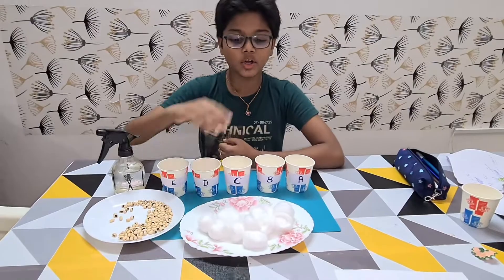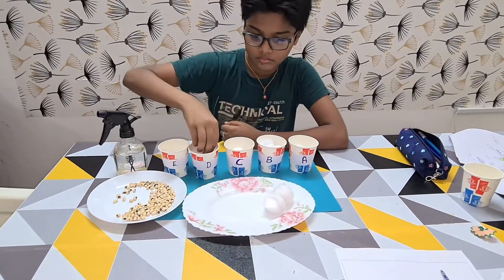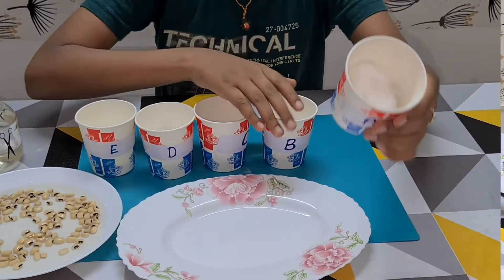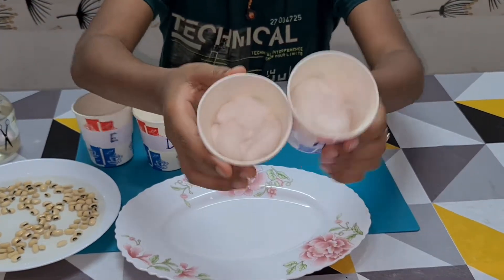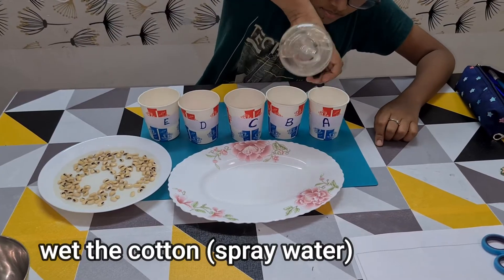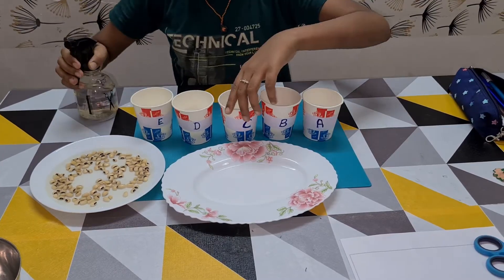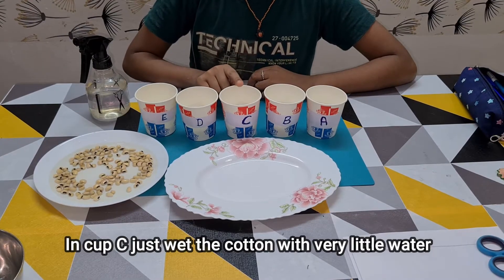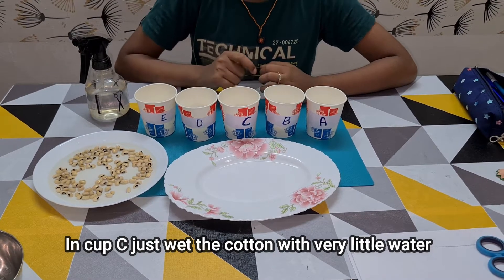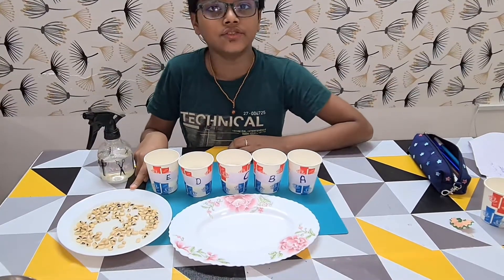Now I will add cotton in each cup. Spray water on the cotton. Here I have soaked the seeds for 1 hour.